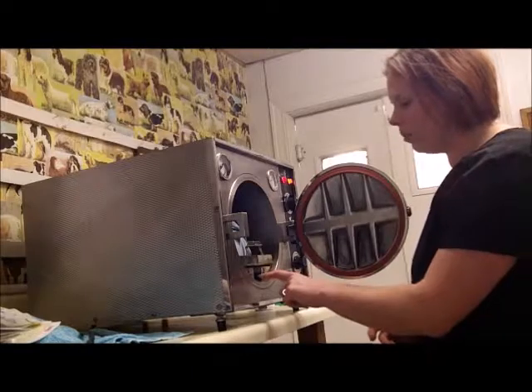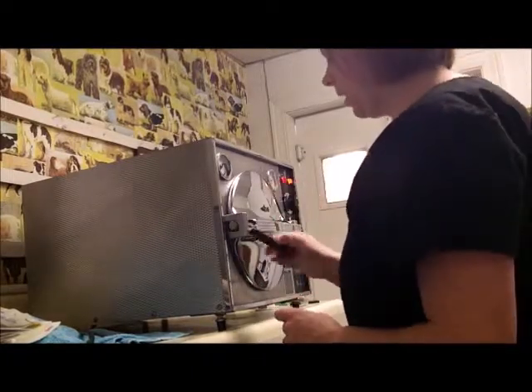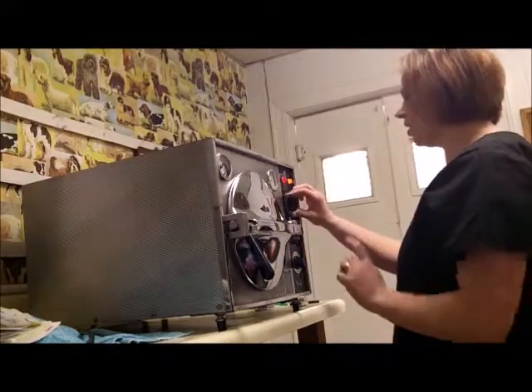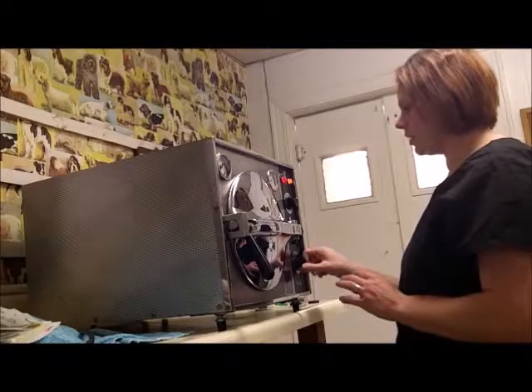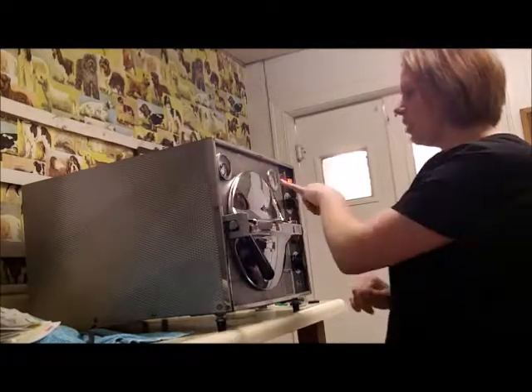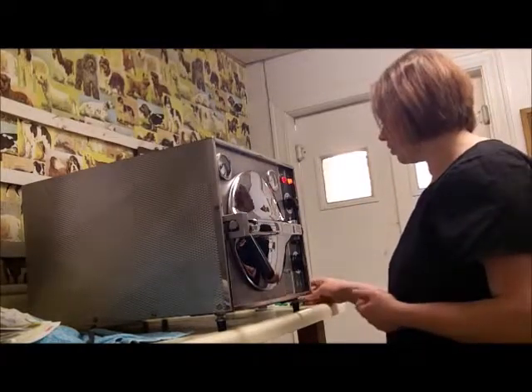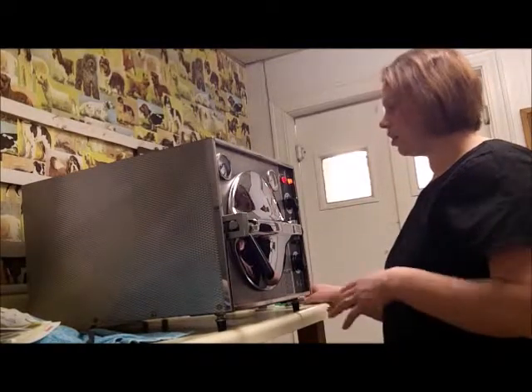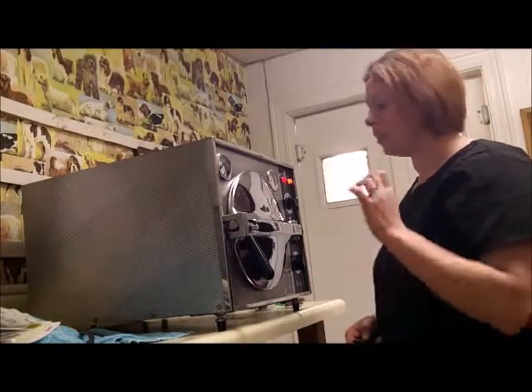So our water is at the fill line, so I'm going to close the door, and we're going to set our timer for 20 minutes, and set this to sterilize. That is going to allow this machine to heat up. The pressure is going to build, and the temperature is going to get to where we need. Again, it takes about 20 minutes. We're going to set that timer. We'll check on it when the timer goes off in 20 minutes to make sure we're at the correct place, and then we'll continue from there.